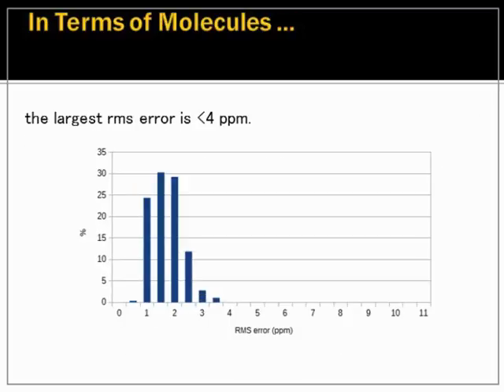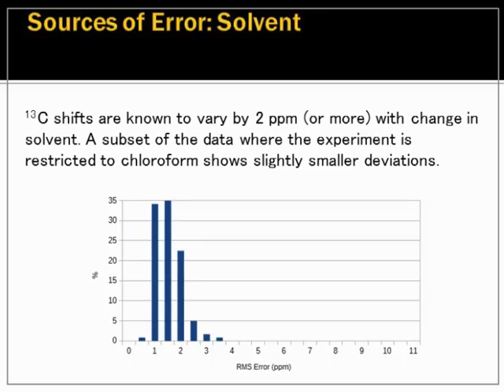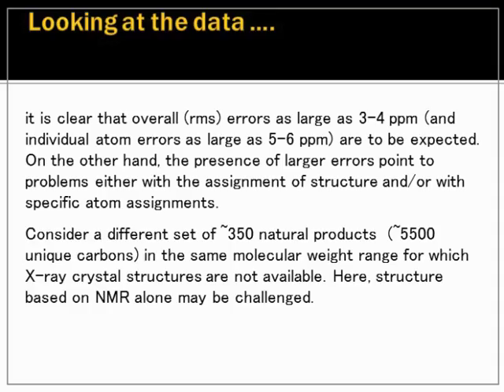If you skip back, this is the molecule distribution. And we have half the number of molecules, so this distribution is tighter. Not by much, maybe 20%. So this suggests that there's a small dependence of the shift itself on solvent. Again, there's not enough data to detect.